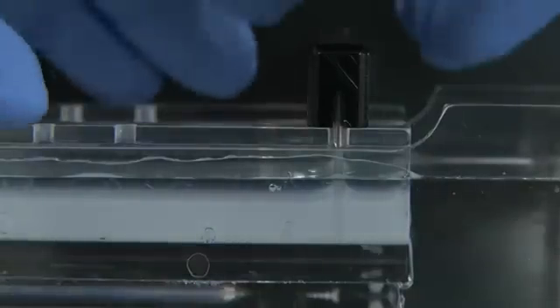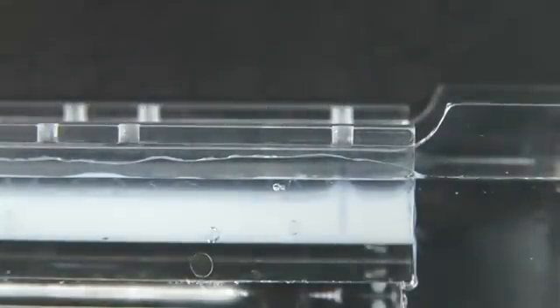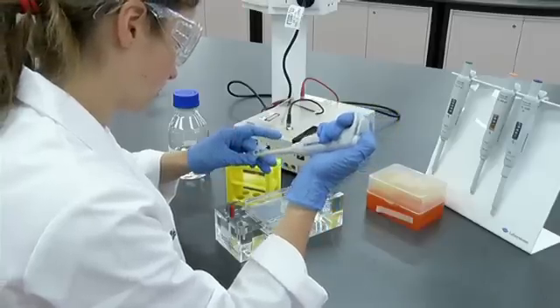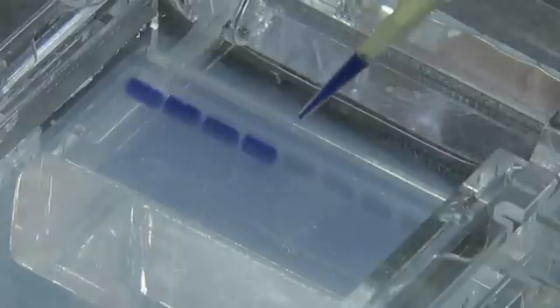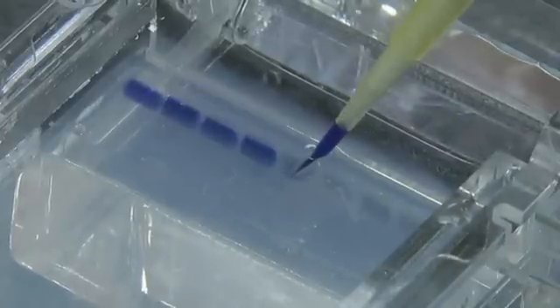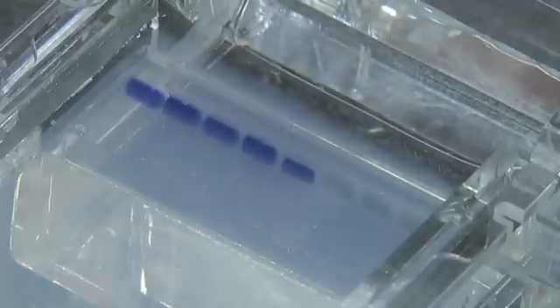Carefully remove the comb. The gel is now ready to load. Often it can help to see the wells if there is a dark surface beneath the gel tank. Load your samples onto the gel. Try to get into a comfortable position and if possible support your pipetting arm. Pipette slowly to allow the denser samples to fill up the wells. Ensure you leave a space for the size markers and record which lanes contain which samples.